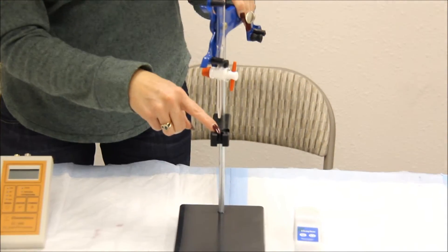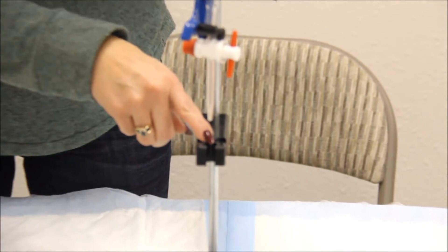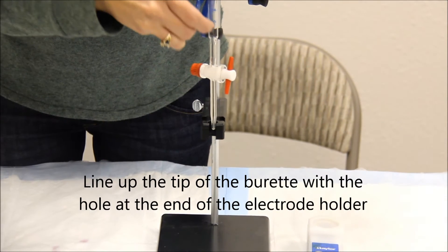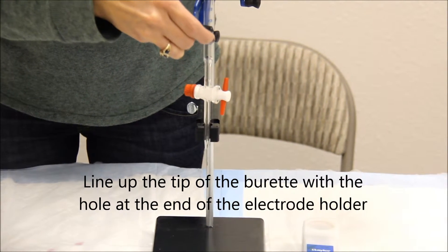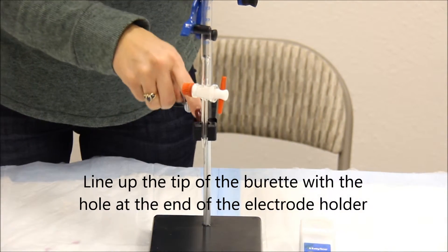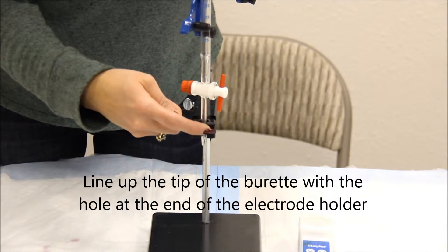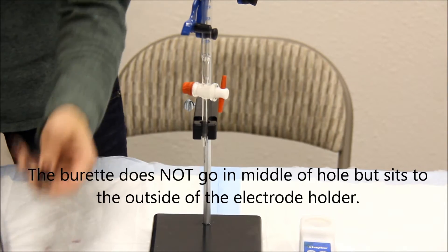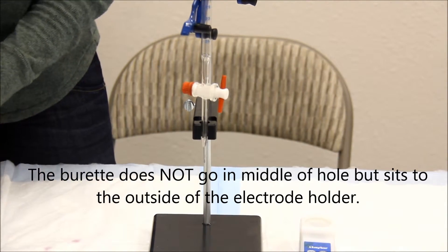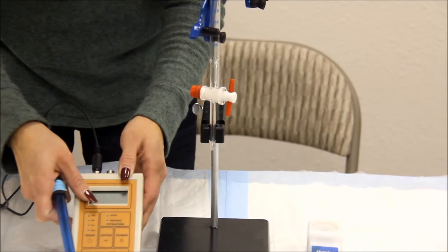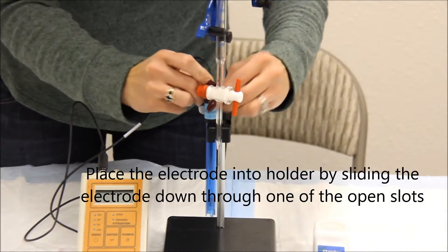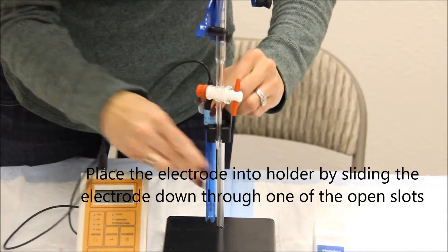Use the front hole of your electrode holder as a guide to where your burette will go. The burette does not fit into the hole but sits outside the electrode holder and just acts as a guide. You can place your electrode by sliding it down into one of the holders.